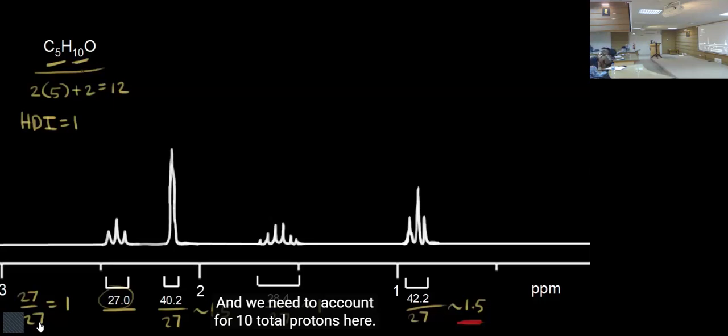And we usually do not have these higher numbers. We have 3.1 something, 2.9 something, but we have to round this up. Definitely there is no 3.1 proton or 2.7 proton like this. There might be a problem in integration, number one, if you do not select the correct area for integration, or number two, there might be some impurities behind your signal that you might not be able to identify.